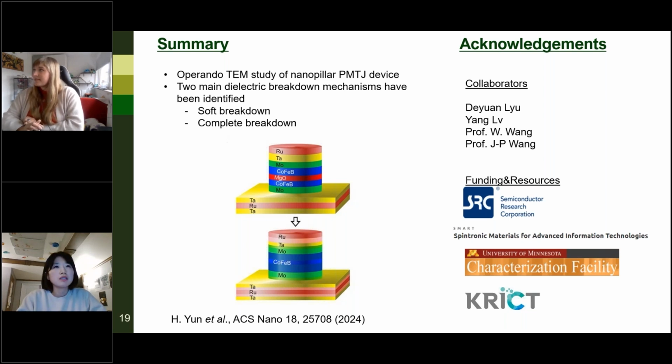So the thing is, I haven't used any other STEM, except for the Thermo Fisher companies. But you know, there are these high angle ADF STEM images, and also low angle or medium angle ADF STEM images, and annular bright field STEM images and bright field STEM images as well. So actually, I also tried to do experiments with the low angle ADF STEM images. Because first of all, high angle ADF STEM image is Z contrast, so it just relies on the atomic number.